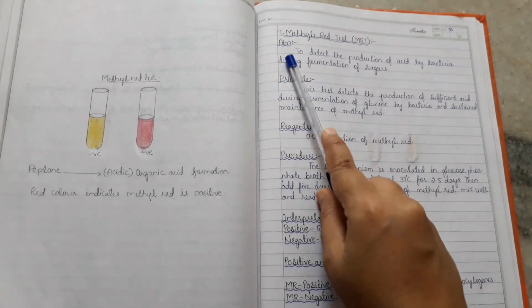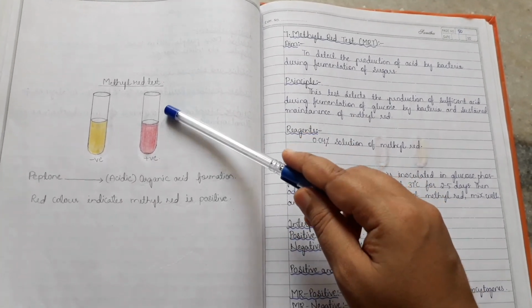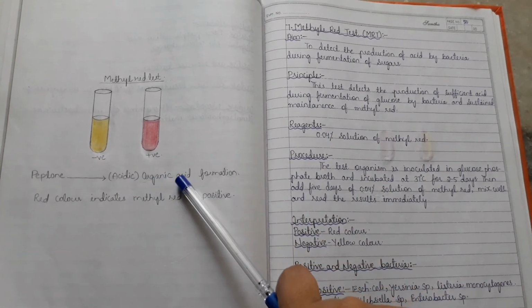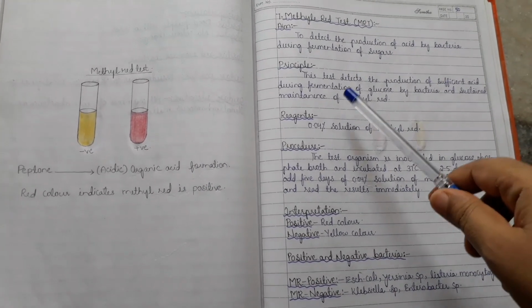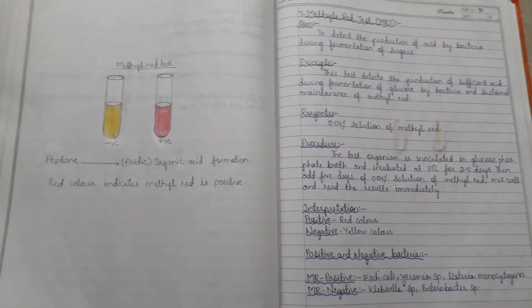So coming to the methyl red test, the positive test shows red color and the negative is yellow. So peptone gets converted into organic acids. So yeah, this is the principle, reagent and procedure, and the positive and negative bacteria.